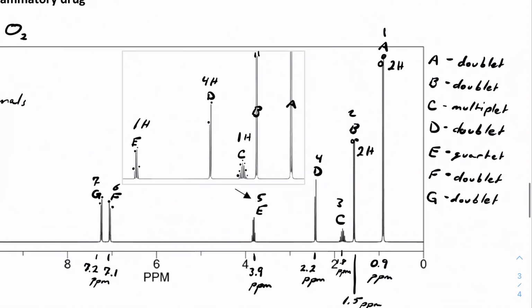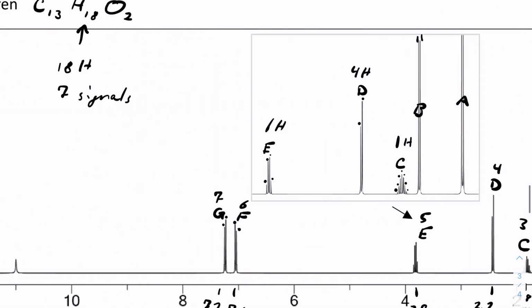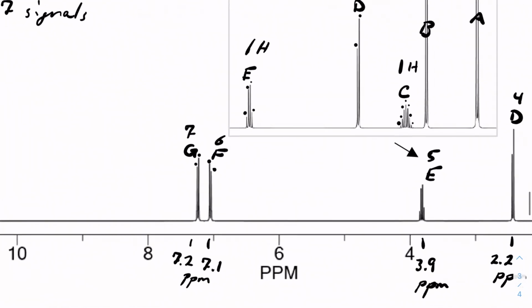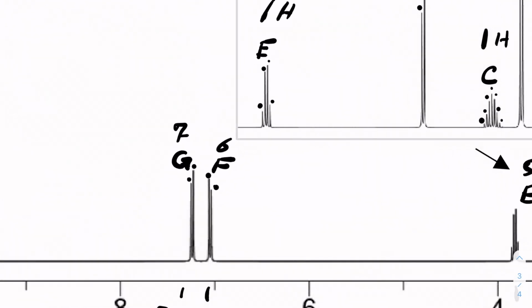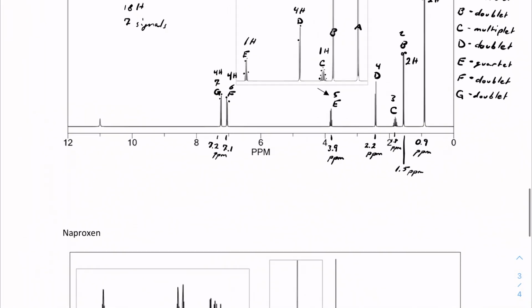And then what we have left, we got 2, 4, 5, 6, 7, 8, 9, 10. So we have 8 left. So that means we're going to have 4 exhibiting at each of these. And then we can, from there, start to kind of take guesses as to what we're looking at here.